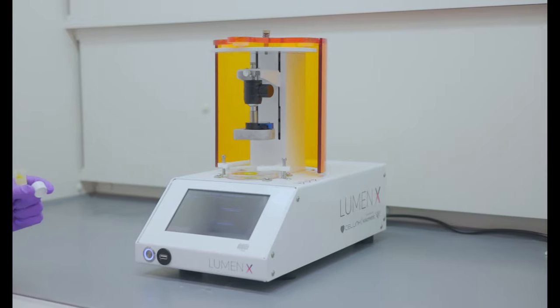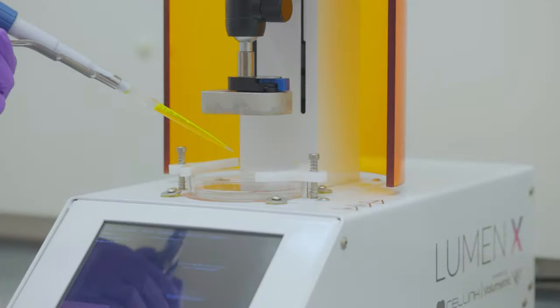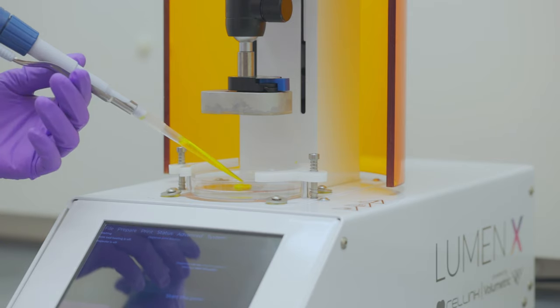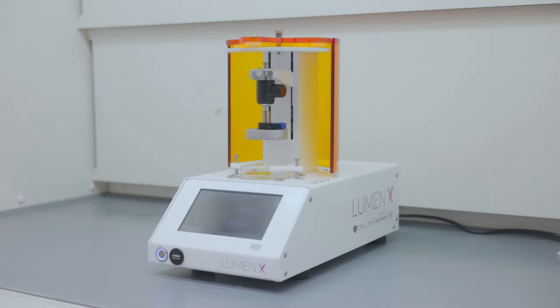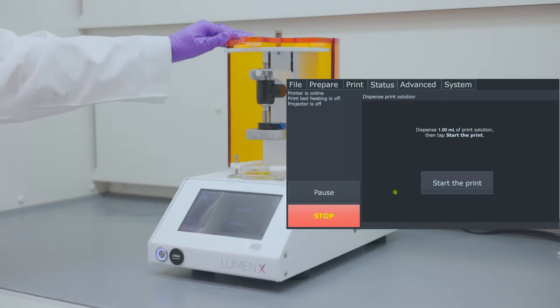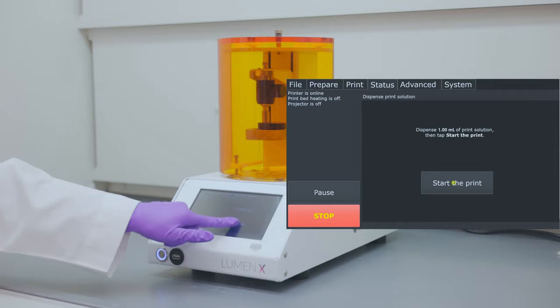Now, add 1 ml of the photo ink into the vat. Close the light shield and tap on start the print.